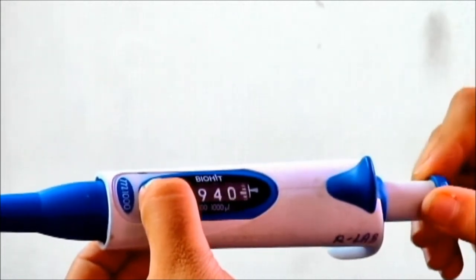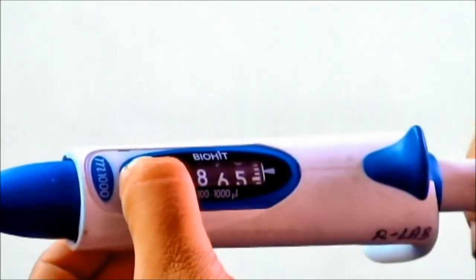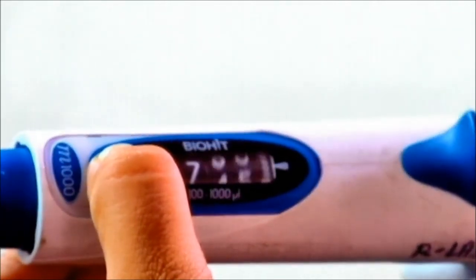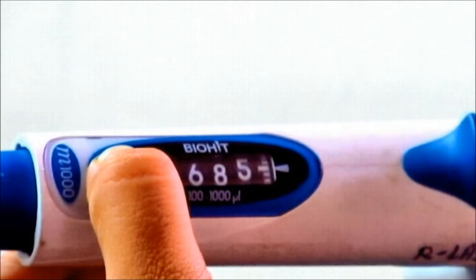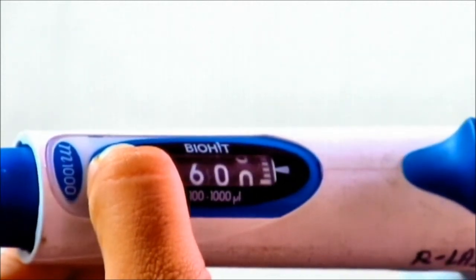For example, to adjust the volume to 600 microlitre, the volume adjustment knob is rotated in a clockwise manner. This is how a 600 microlitre volume has been achieved.